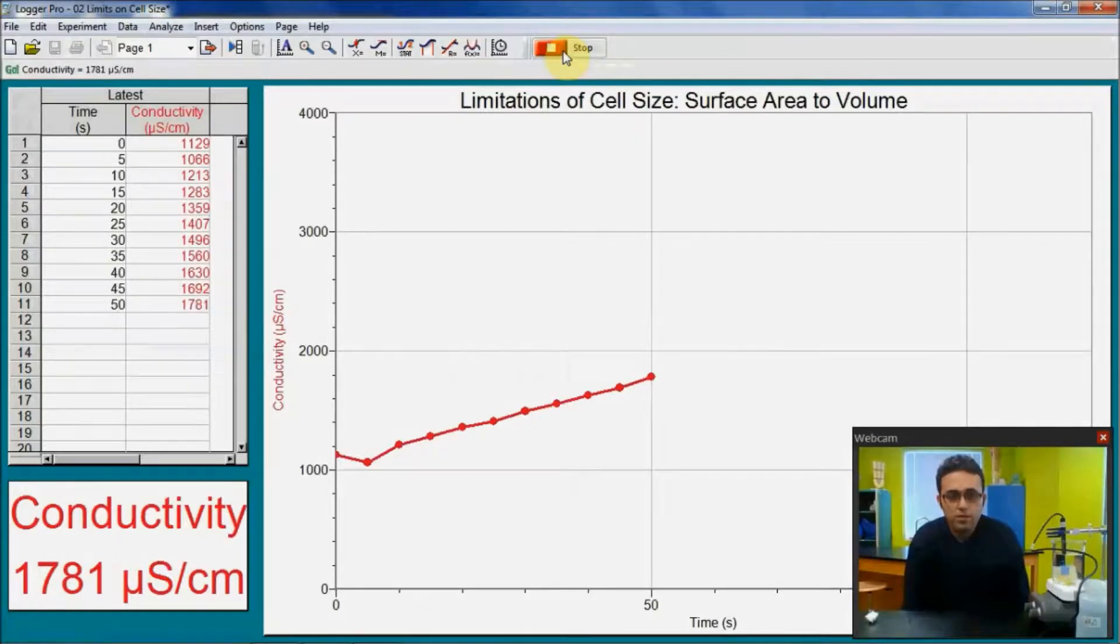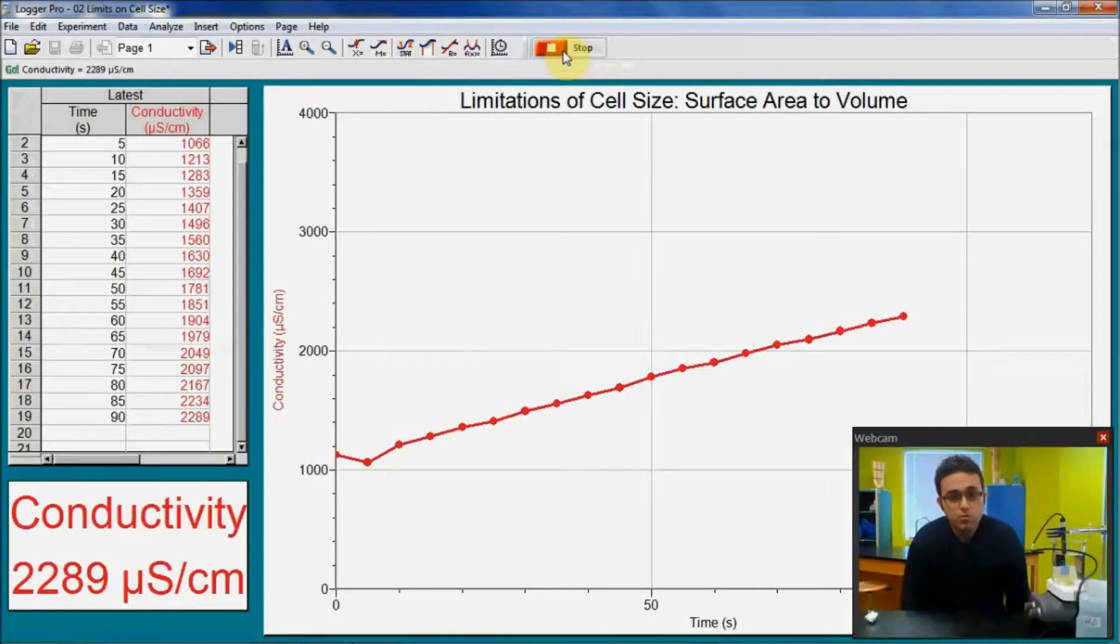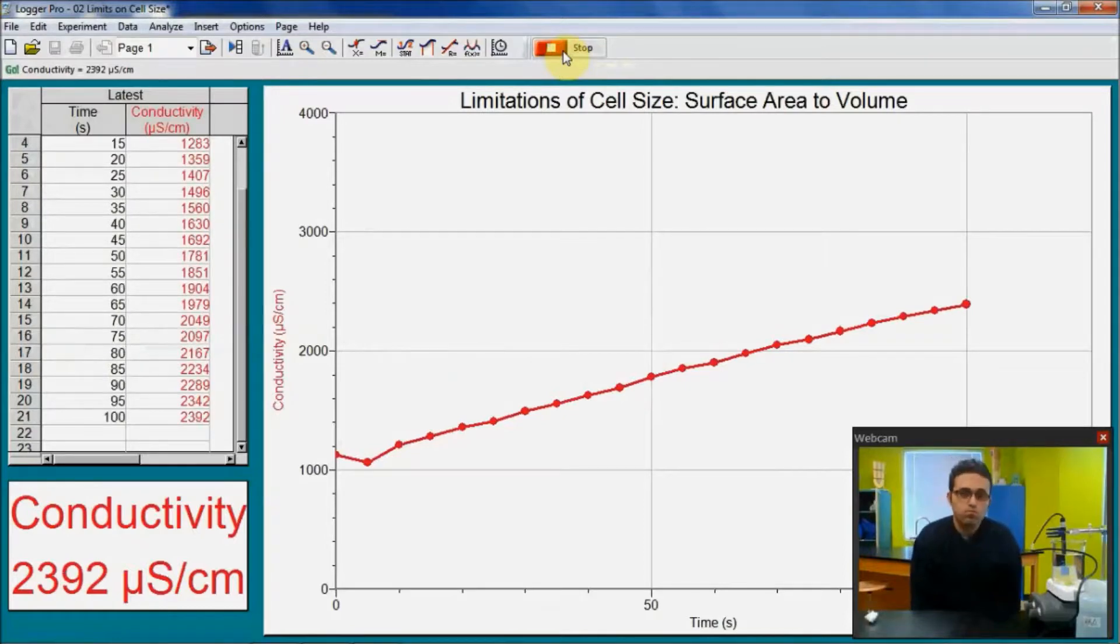So after data collection is done, you will have to draw a best fit line for these plotted data and calculate the rate by finding the slope of the best fit line. Well, using this software, LoggerPro, you can easily find out these values because the software calculates it for you. But students will have to copy this data and plot their own graph, and then do their best fit line, and then calculate the rate by hand without using this property of the software.